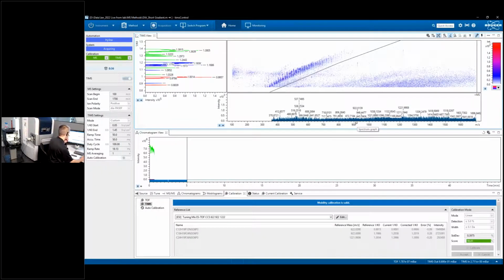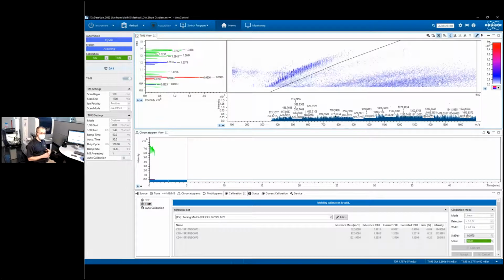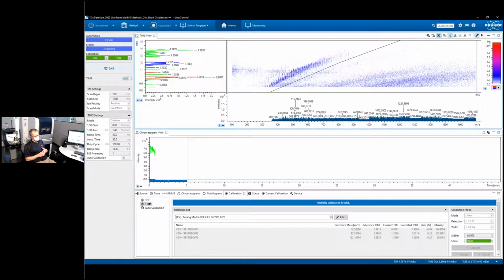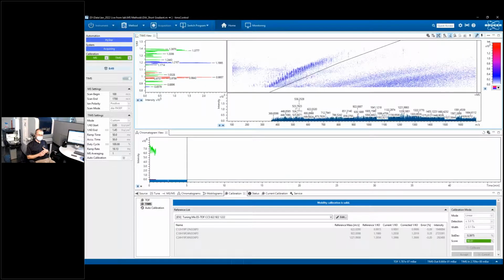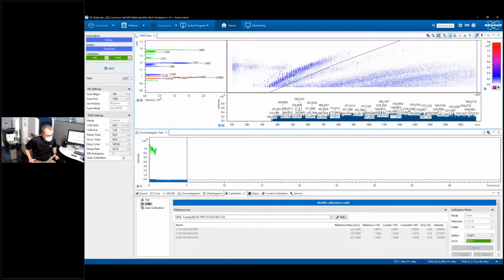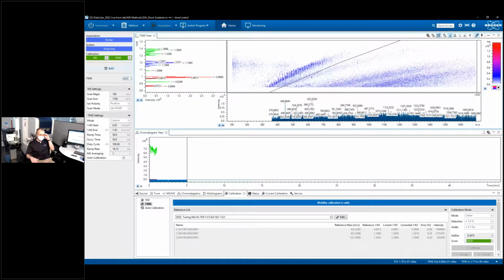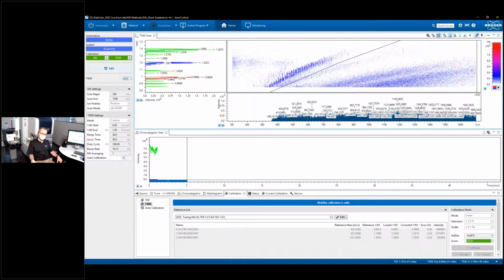Is there any difference between doing library free and library searched for peptide detection reproducibility, or do you feel it's the same, or does it not matter? In my experience, it's been pretty similar between the two in terms of reproducibility. I haven't seen any major differences there. But it is still the case that a good library will outperform library free in most cases.